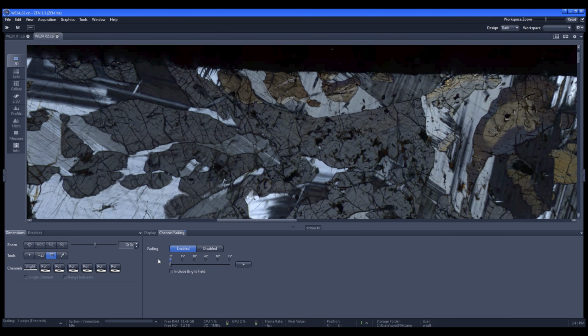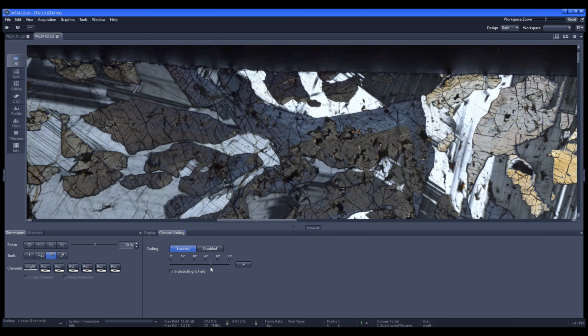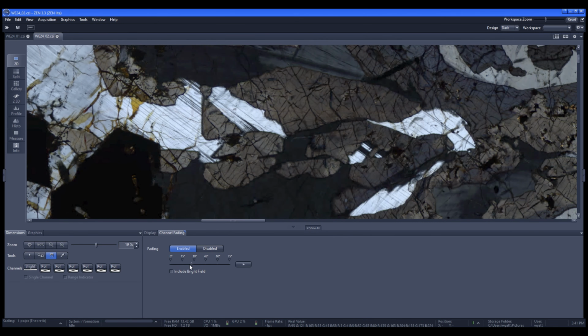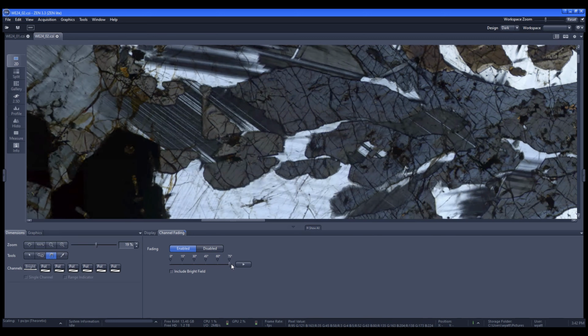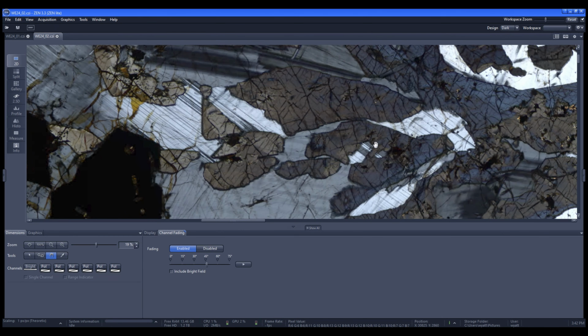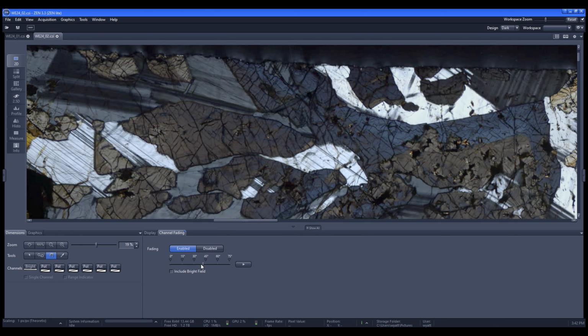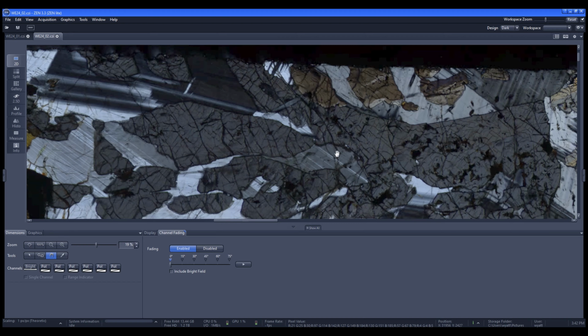And there are several different types of amphiboles in composition. One example would be hornblende, but I'd have to do tests to determine if this is actually a hornblende or a different type of amphibole. And I'm going to lean towards a different type of amphibole because typically in thin section like this, hornblende would be green. This amphibole shows no sign of green at all, so I don't think it's a hornblende. So it's likely some other type of amphibole. And it's typically something you don't see in the basalt.